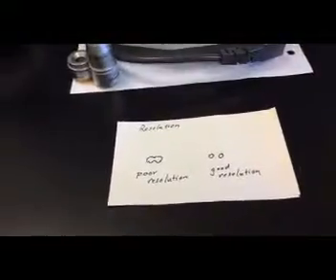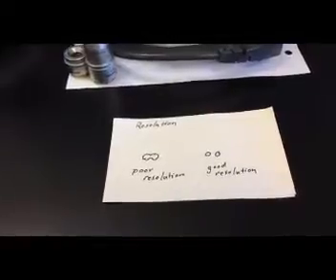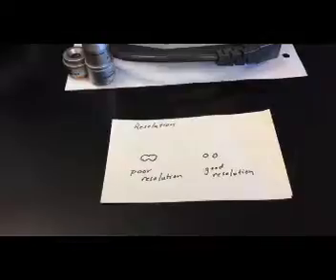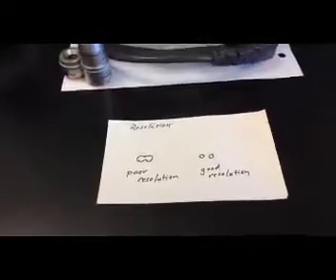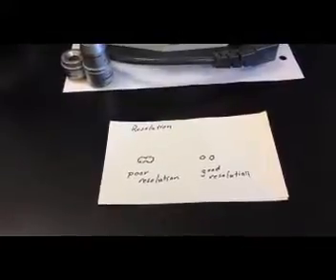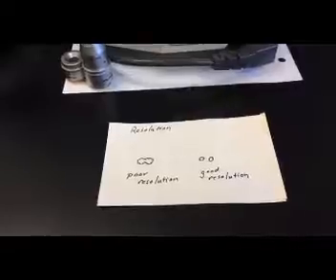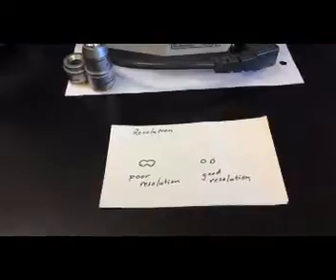So if we presume we have two small cells, two small objects that are placed very close together, and we are looking at these two cells using a microscope that has poor resolution, you can see in our little cartoon here that the cell outline appears blurry or fuzzy. It's hard for us to tell, is this a single object that's kind of dumbbell shaped, or is it indeed two separate objects or two separate cells?